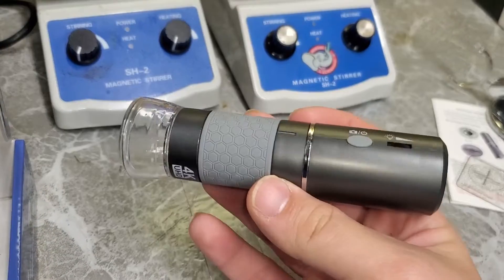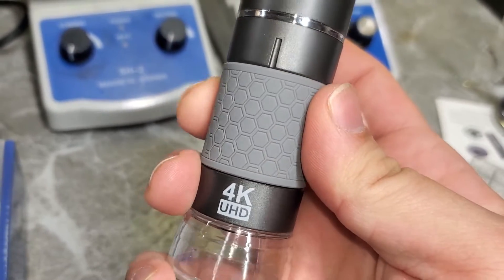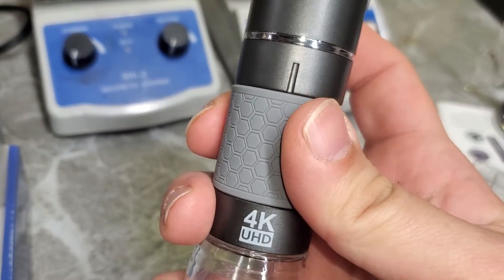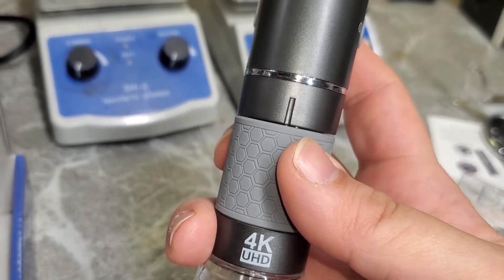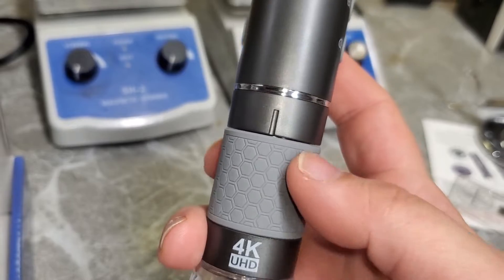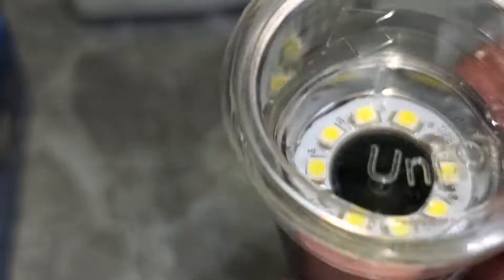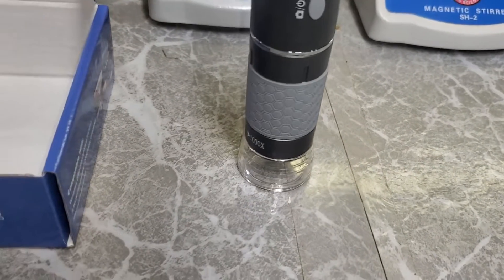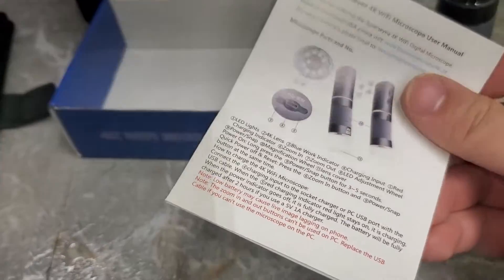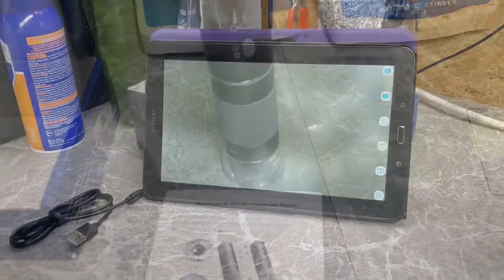The focus adjustment ring feels very smooth and precise — very gradient, actually. It moves the lens up and down to focus. I'm going to follow the instructions and download the app onto my tablet.